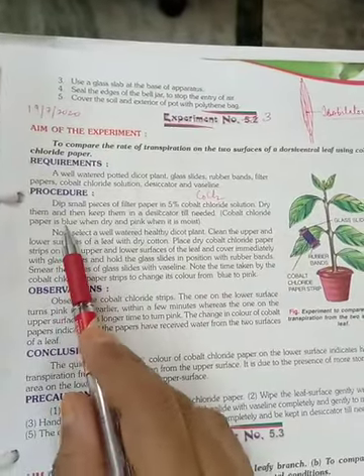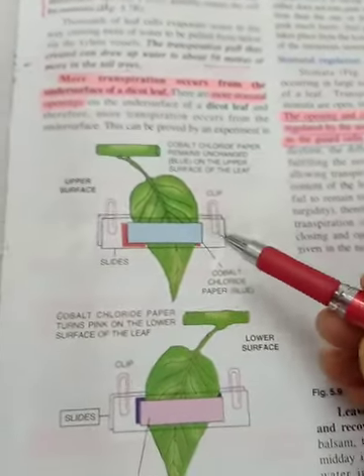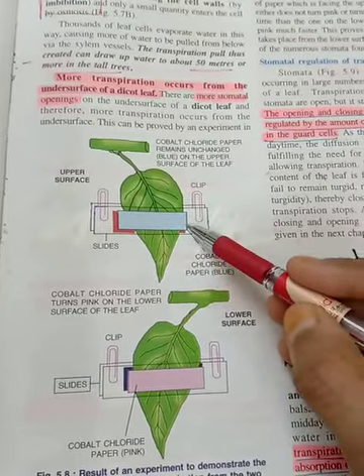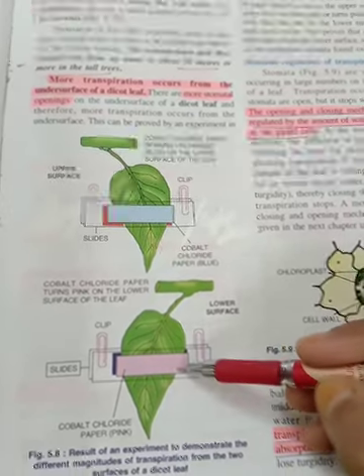CoCl2 paper is blue when dry and pink when moist. I'm sure you remember this experiment, children. The cobalt chloride paper is blue in color when it does not have any moisture, that is, in a dry state. But the moment it absorbs moisture, it changes color to pink.